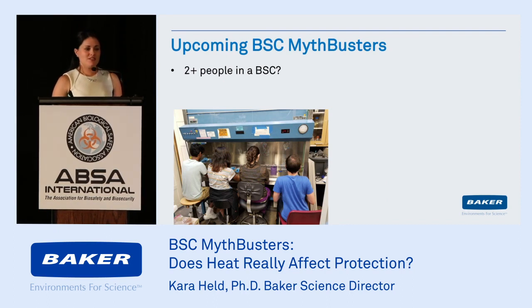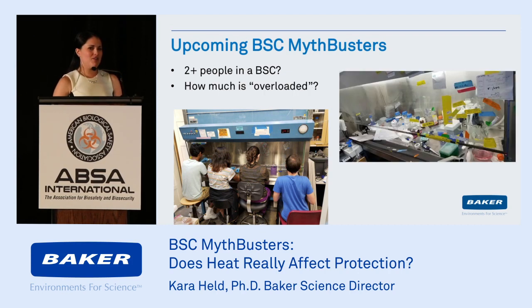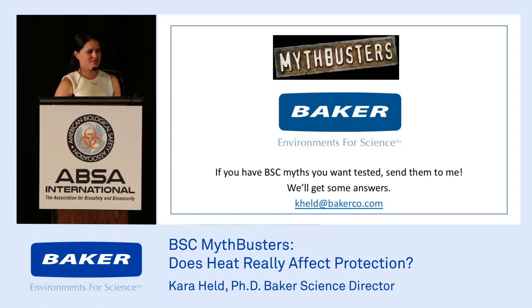Some upcoming Mythbusters you'll see from us. How about two or more people in a biosafety cabinet? I can guarantee their cross-contamination is compromised. How about how overloaded is a biosafety cabinet? So we're going to see how much stuff you can actually put in there before compromising your safety.